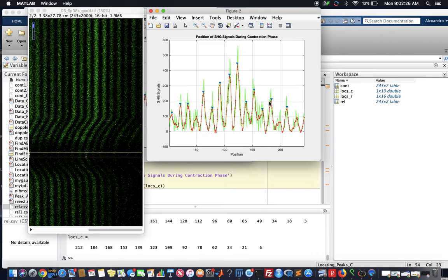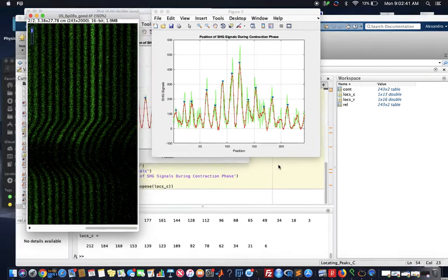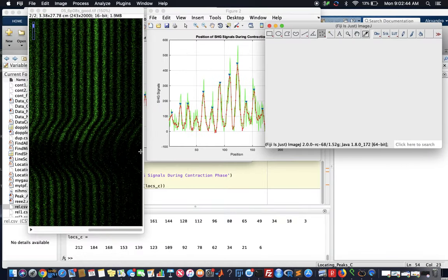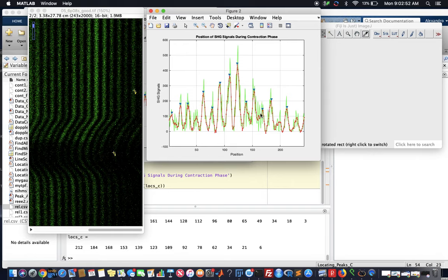So we're going to want to start off here. So on this image here, we will be starting on the 4th band. So it's going to be a little confusing because when we do the index, it's going to be technically number 2. But on this image here, we're going to be 1, 2, 3, 4, band number 4. Alright, so I always mark these bands just to keep it simple. 1, alright, and then 4, 6, 7, 8, 9, 10, 12. Alright, 12, so 4, 5, 6, 7, 8, 9, 10, 11, 12.